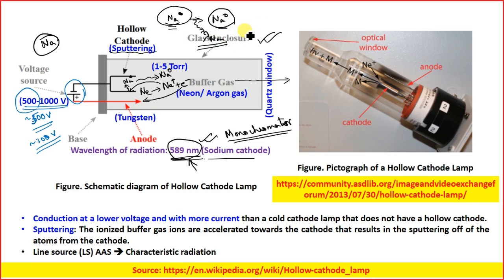Lambda sodium. Okay. Now, if I have to excite another atom, I have to use this lambda Na to excite this sodium atom. This is the property of all of the metals. So if you excite them and find out the spectrum, you will find a very strong peak at a particular region. There may be other peaks, but those will have very small values. Okay, so this is why we use the hollow cathode lamp.